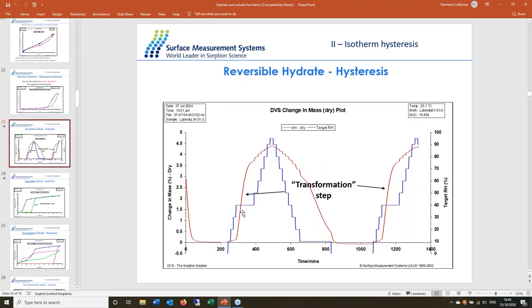So what it does is basically adapt the length of each stage to the equilibrium criteria required by the sample itself. So in that way, we don't have to know exactly how much time it requires for each stage to reach equilibrium. It's done automatically by the software.